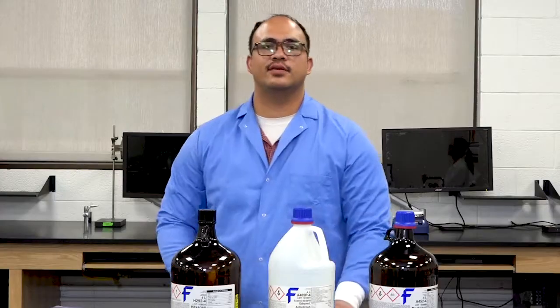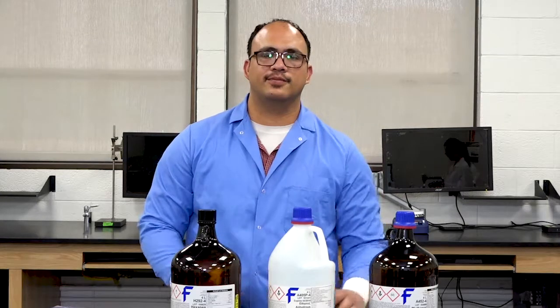As the solvents travel through the paper medium by capillary action, that's going to be the force enabling our samples to move through the paper. Now, the rate of movement for this chromatography depends on the attraction between our sample and the polar stationary phase and whatever solvent we introduce, whether it's a more polar solvent or a non-polar solvent.